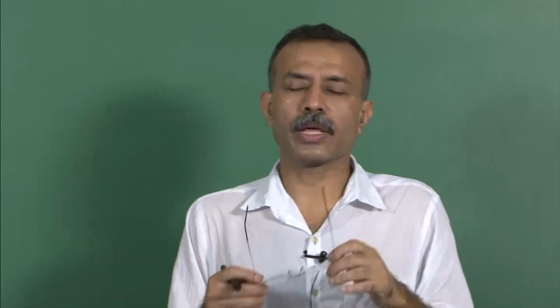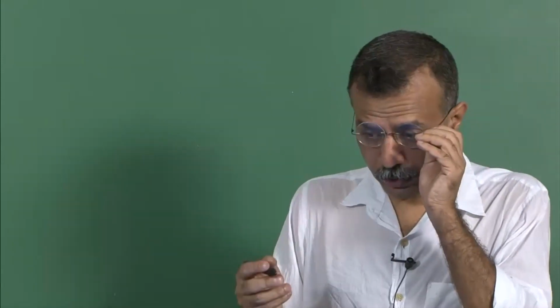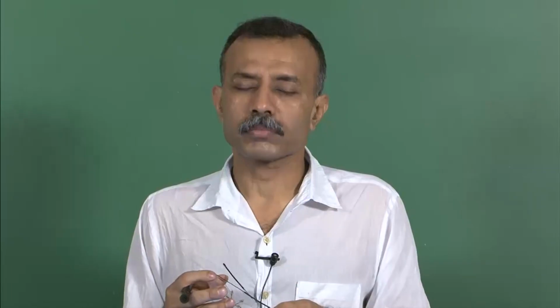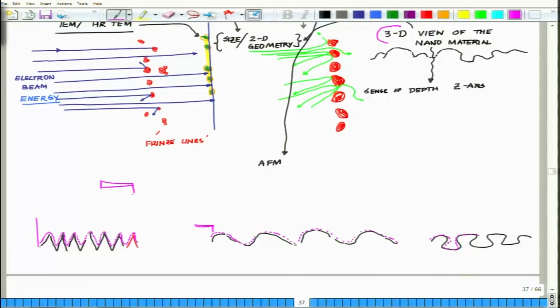Okay. So, this is the third very powerful technique where you should be able to see another aspect which partly we observed using scanning electron microscopy, a three-dimensional aspect.